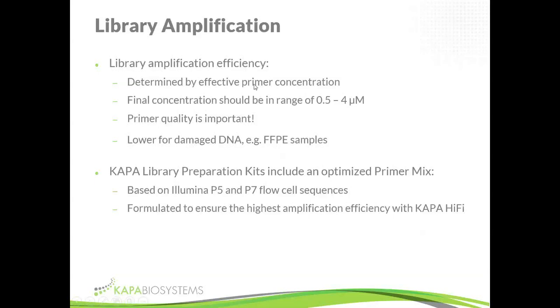And so for library amplification, we use primers at a much higher concentration. The quality of your primers is important because that determines the effective concentration. So make sure your primers aren't in water and that they don't degrade. And there are a few other things you can do to primers to really make sure they're good quality.